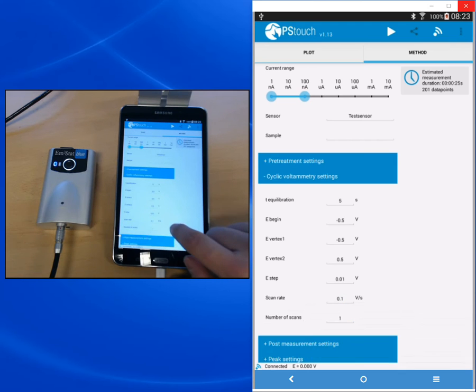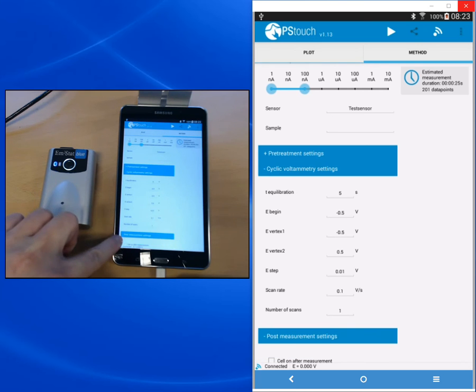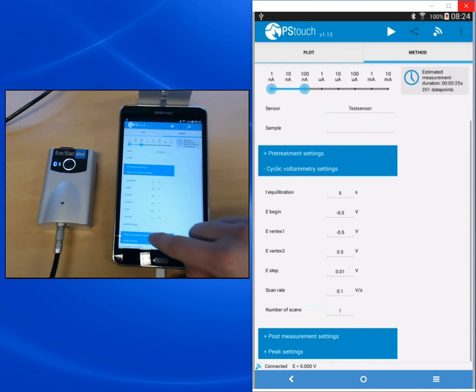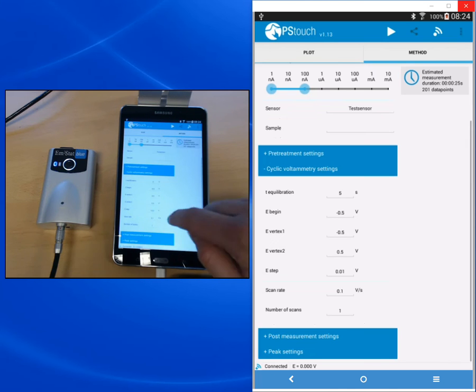As scan rate, I'm choosing 100 millivolts per second (0.1 volts per second), which is sufficient for this measurement. The number of scans we leave at one, because you only need multiple scans if you want to observe whether your reaction is stable — we don't have a reaction here. Under the post-measurement settings, you find an option to keep the cell on after the measurement at a defined standby potential, useful if your electrode would suffer under its own OCP. The peak settings are left at their default values — you only need to change them if you're not happy with the automatic peak detection.